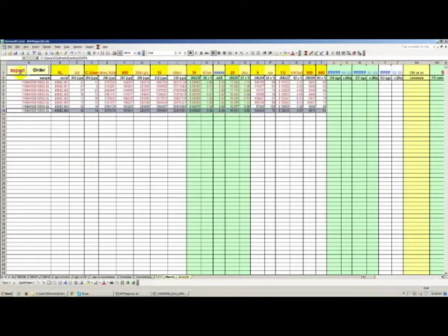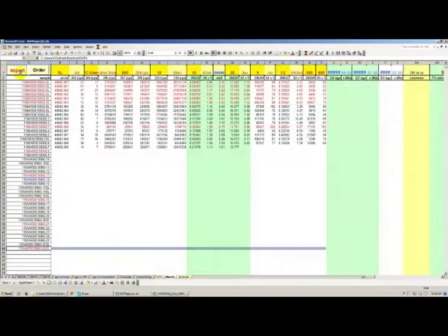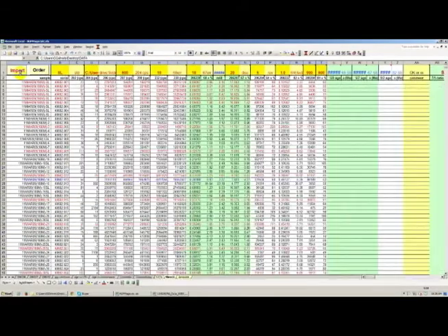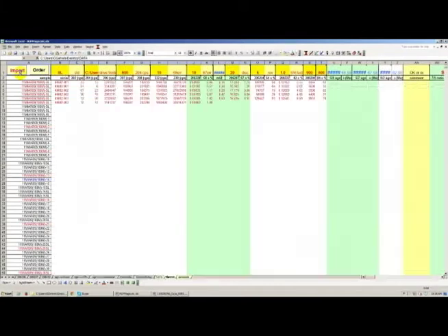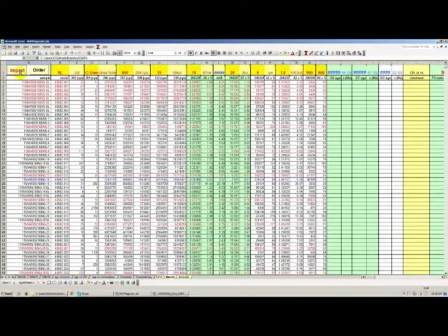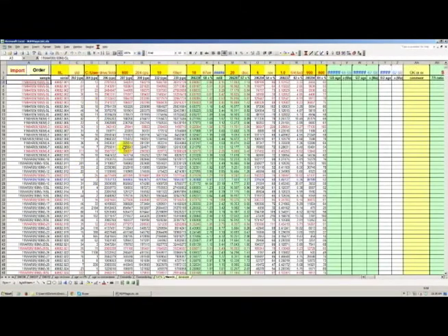What the program is doing right now is going down that txt file, spot by spot, and doing the down-pit fractionation correction of each one of these points by performing a least squares regression through the acquired data. Once it's done, it's going to take about 30 seconds for the detrital sample to import all the 100 and something spots that you've analyzed.